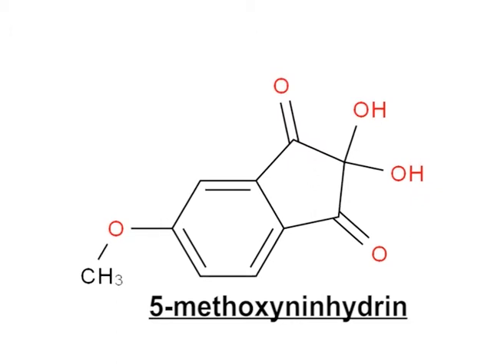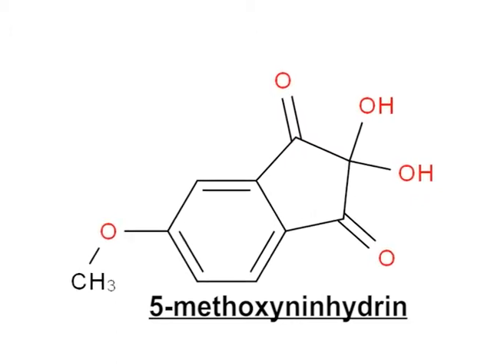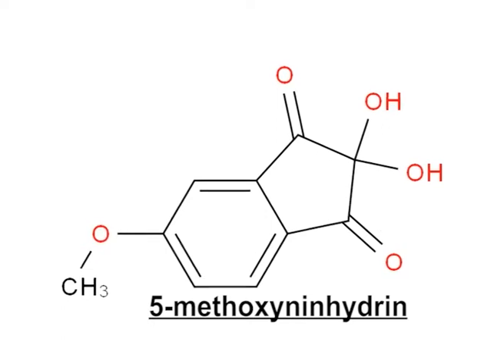Another ninhydrin derivative which develops latent fingerprints with appreciable degree of sensitivity is 5-methoxy-ninhydrin. On paper, this reagent produces fingerprints as efficiently as ninhydrin. Yet, fluorescence after zinc chloride treatment is considerably stronger than with ninhydrin, particularly when examination is carried out by a copper vapor laser. 5-methoxy-ninhydrin has also proved useful for developing fingerprints on counterfeit currency.